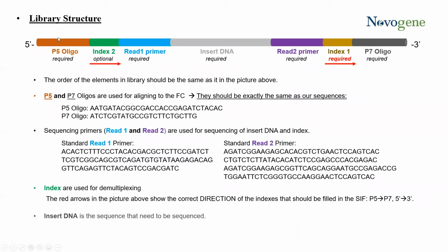These here, the oligos, are what actually bind to the flow cell and allow for amplification to occur, as well as sequence by synthesis. In the workflow one, we would have seen a bridge amplification. So the P5 would have been bound and the P7 would reach over to another oligo on the flow cell and extend. But in this case, we are just producing the read 2 strand and going a different approach. So we have the oligos here. We have our indices, right?